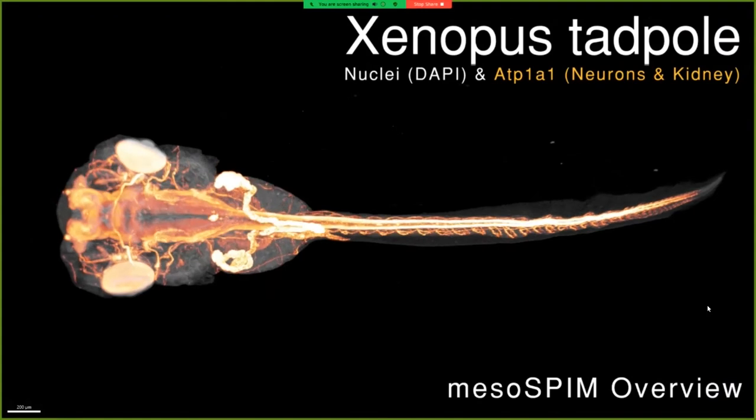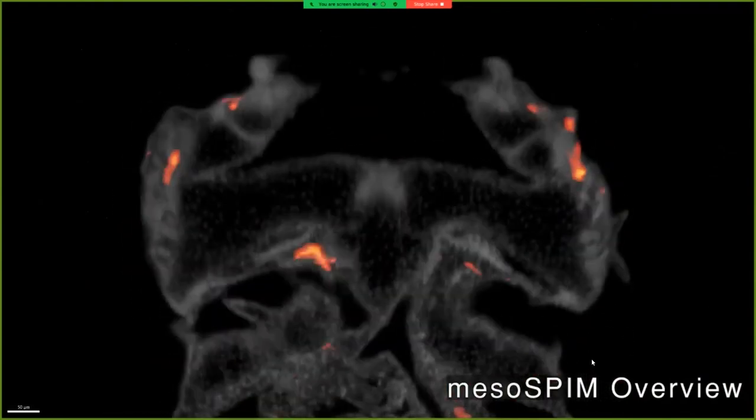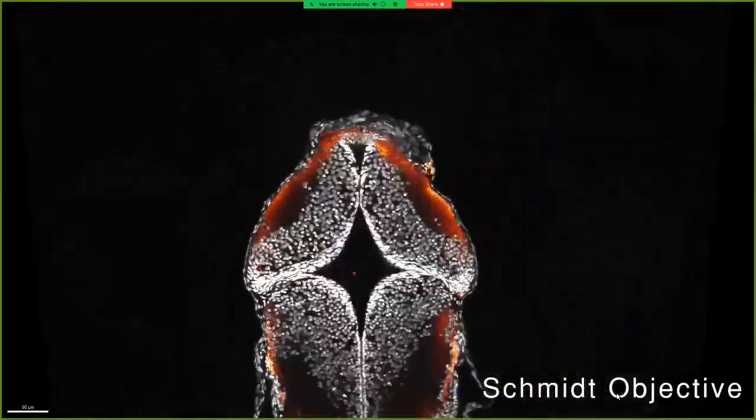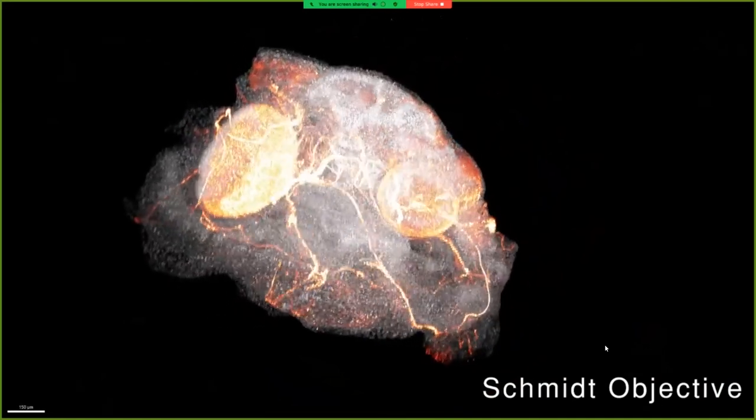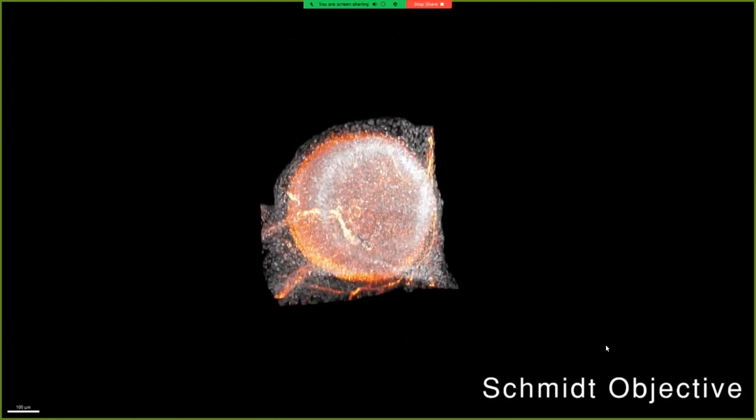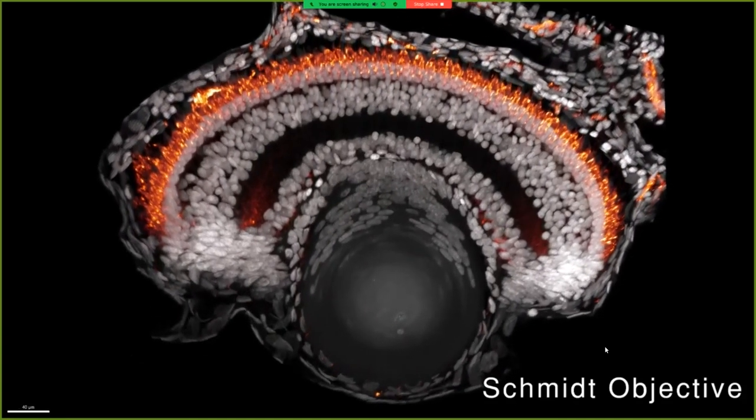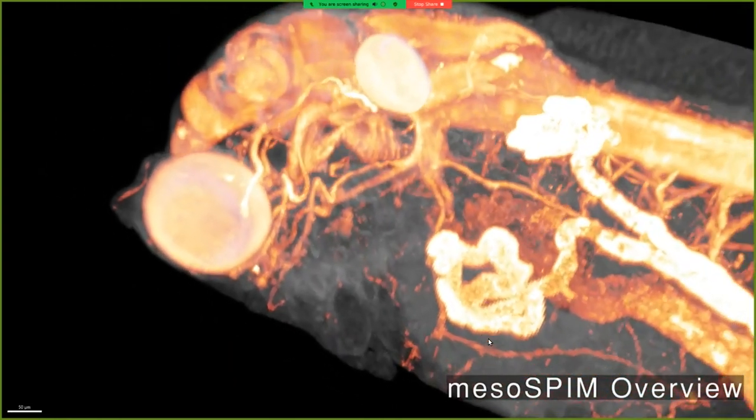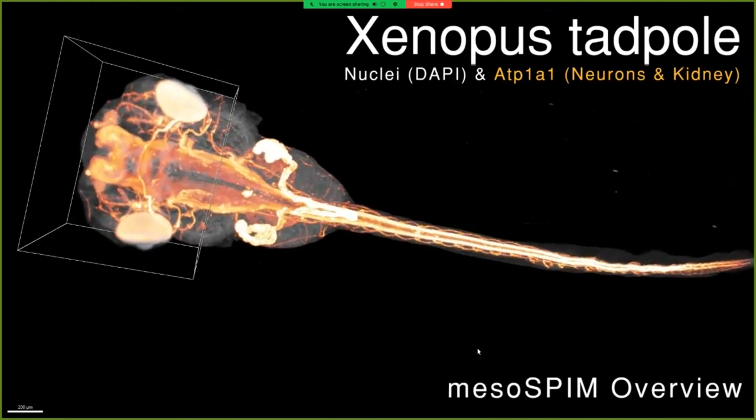Another example is that we can image a whole organism, in this case this is a Xenopus tadpole, which is a couple of days old, and then in this case we're taking a mesoSPIM overview, so a light sheet overview of low resolution. Here you can see nuclei stained with DAPI, and then we have an antibody stain against part of the peripheral nervous system, and we can transfer the sample to the Schmidt objective and image at much higher resolution. We can visualize this data set in 3D, and you can see this was done with a single stack with a field of view of slightly below a millimeter, and we can within this larger data set then, for instance, select a sub-region for scanning at higher resolution. And so here we selected one of the eyes, and we can nicely generate, in this case a digital section, through this eye where you can see the developing layers of the retina and the developing eye plus developing photoreceptors in orange. And all of this is done in the complete sample, which in this case is roughly five millimeters long, so this is basically multimodal imaging using both a mesoSPIM light sheet microscope and the Schmidt microscope objective.